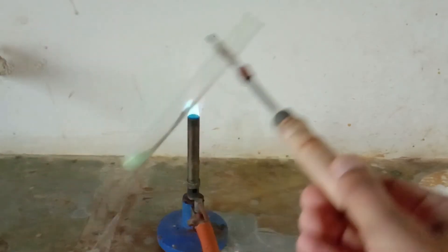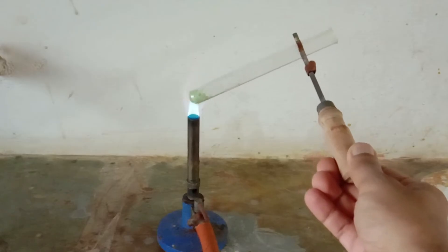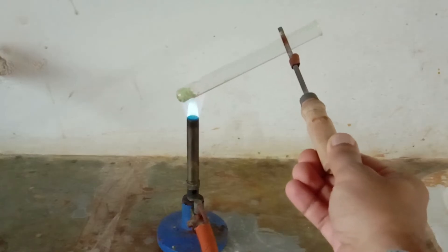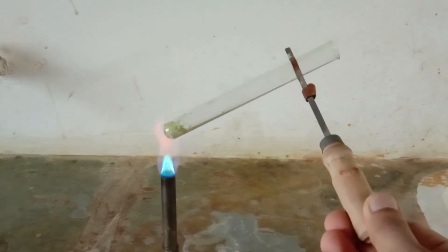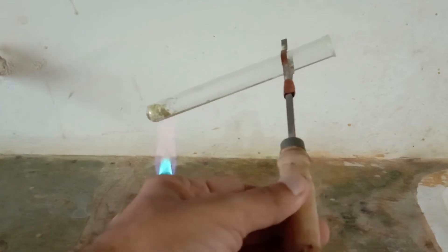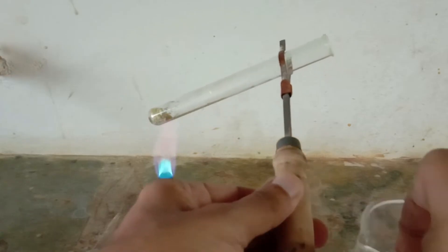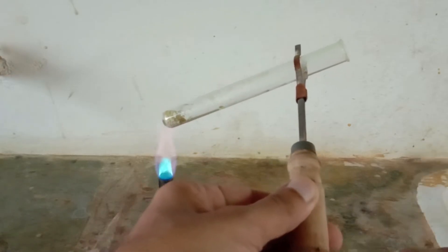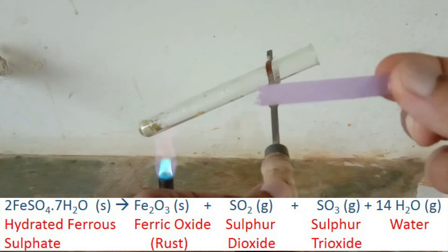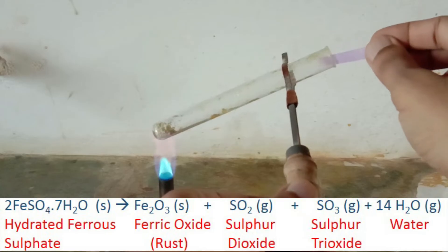Now let's heat it. This crackling sound is from the water molecules which were present in FeSO₄. These water molecules are now evaporating out of the hydrated FeSO₄.